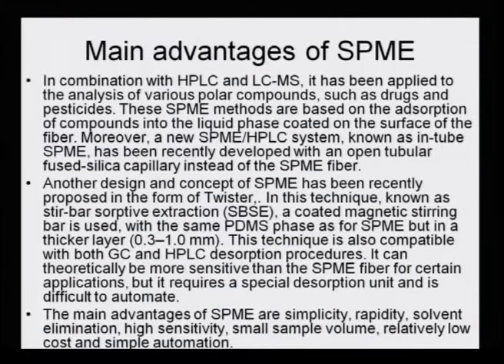These SPME methods are based on the adsorption of compounds into the liquid phase coated on the surface of the fiber. Moreover, a new SPME HPLC system known as in-tube SPME has been recently developed with an open tubular fused-silica capillary instead of the SPME fiber. So, more and more recent advances have actually taken place according to the need of the extraction.